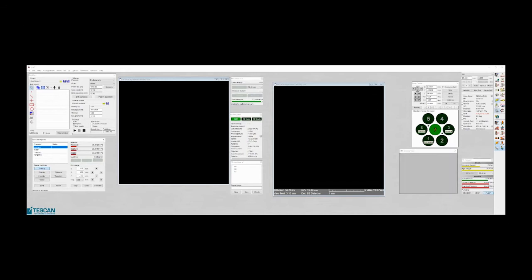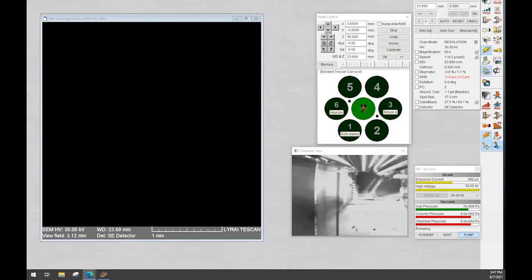Okay, probably I will try to do something with this effect. I will stop sharing and try to start it again. Share the screen. Okay, I can choose only one of it. Will it be better? Yeah, now it's better. Okay, so we will start even with scanning electron microscope. So I will share only the right part, and then I will change it.